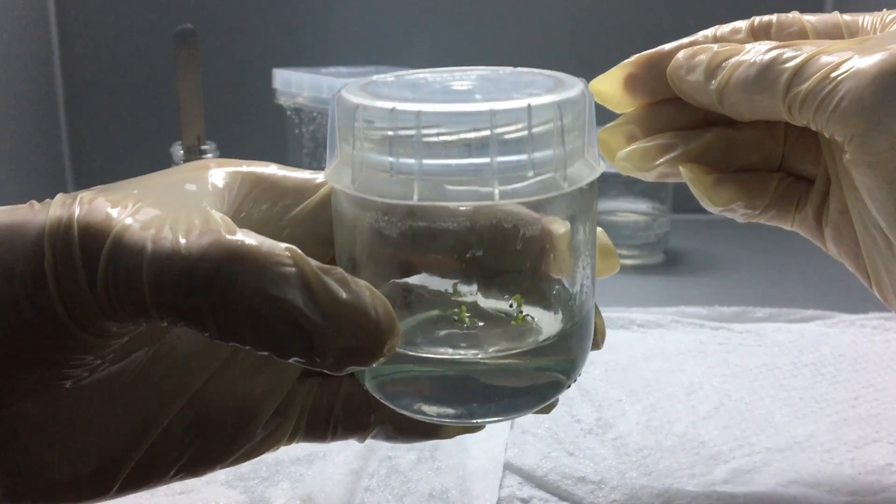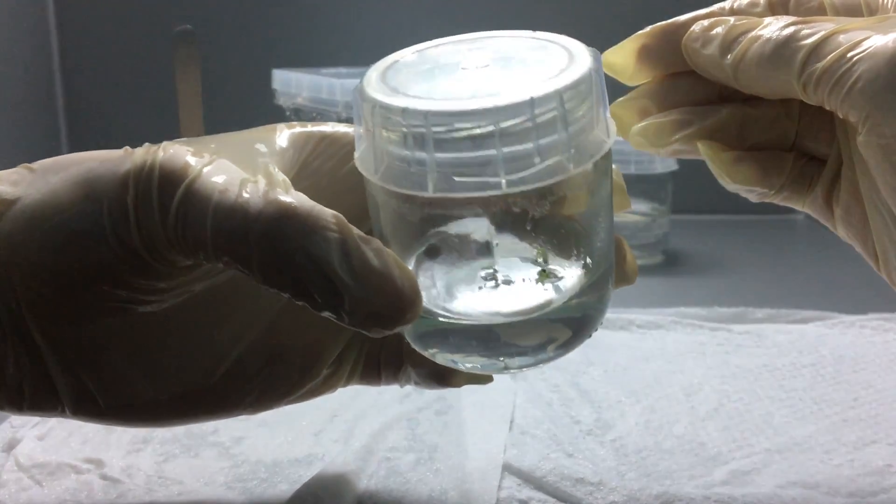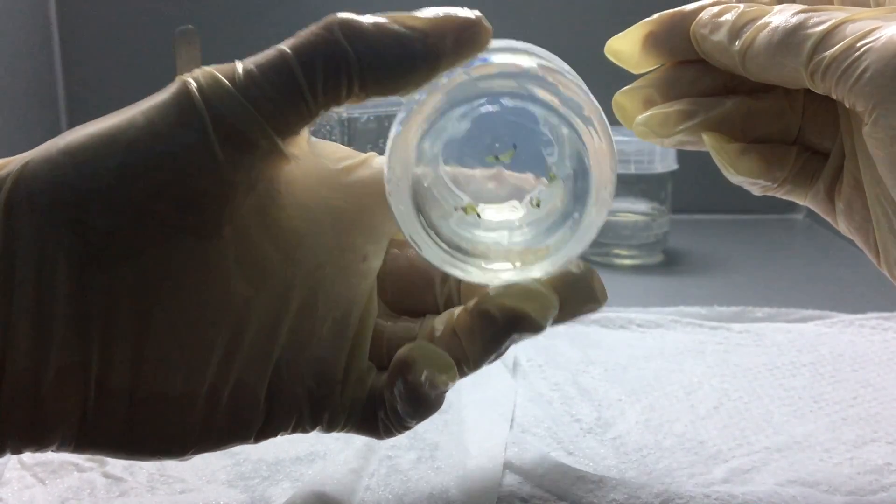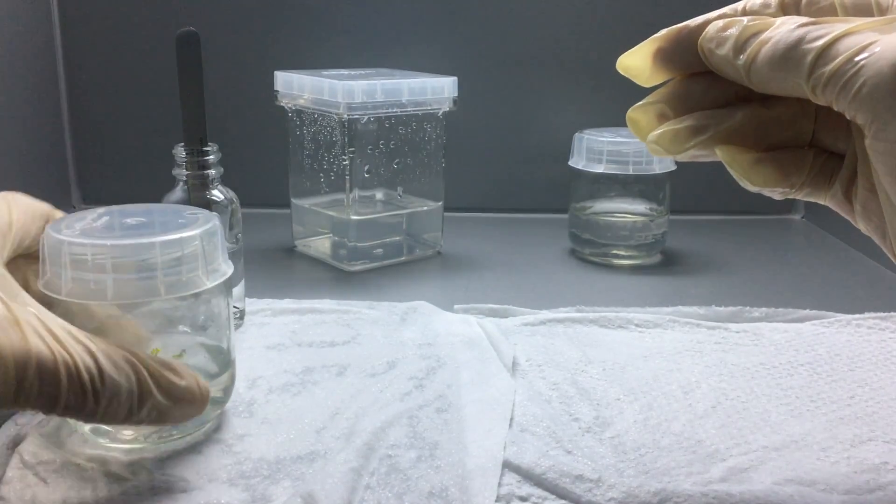Right here I have a culture of Dionaea muscipula seeds, well seedlings now. I planted four of them, and I flasked up four of them, and I got 100% germination.